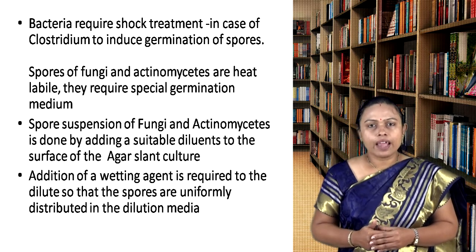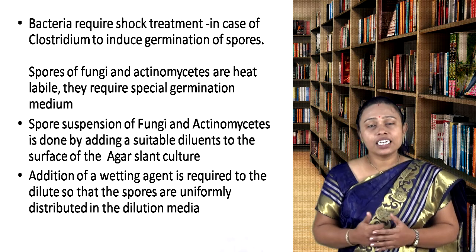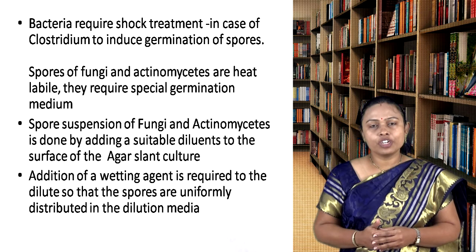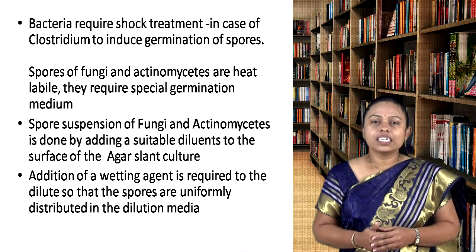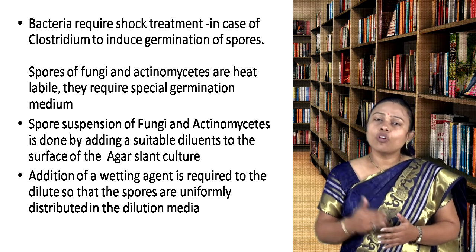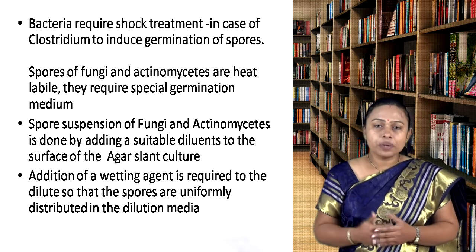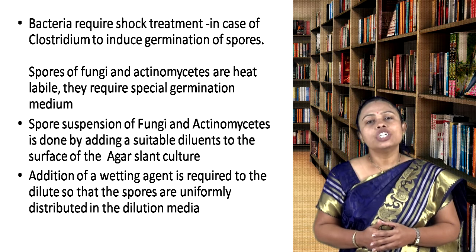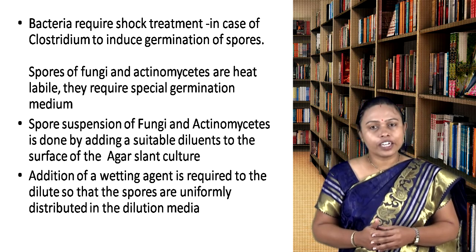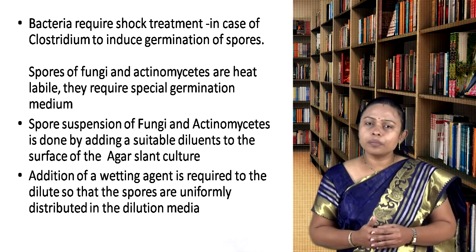Spores of fungi and actinomycetes are heat labile and they cannot be exposed to treatments like heat treatment. In contrast, they require fixed temperatures for germination, and they also require a special medium which may induce germination faster. Germinated spores are then transferred to the normal inoculum medium.